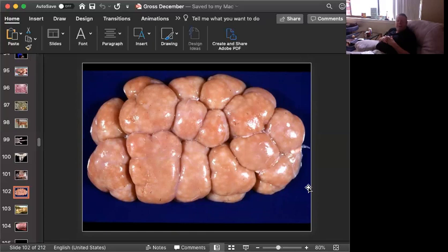What I want you to look at are these white spots on the kidney. And this is a condition that since time immemorial has been referred to as white spotted kidney. And white spotted kidney generally arises from a subclinical bacterial infection. It could come from an infected navel and be part of navel ill. It could also come from a shower from the intestine, but it is generally considered to be the result of a mild, non-fatal gram-negative sepsis. It goes to the kidney.